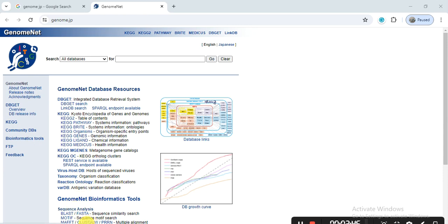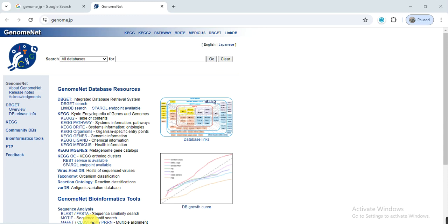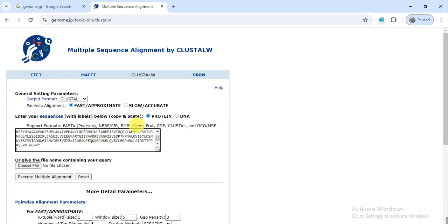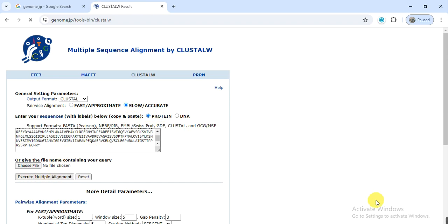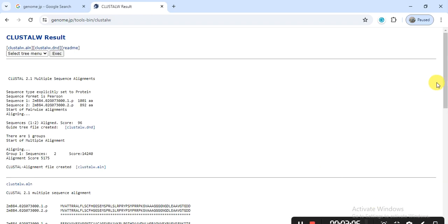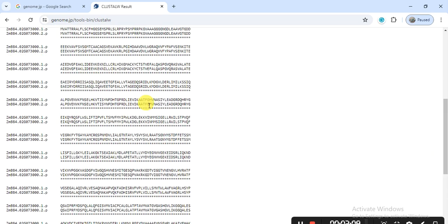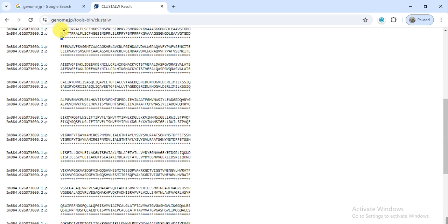On genome.jp, click on ClustalW, then paste your sequences. Select protein-protein and then execute the multiple alignment.